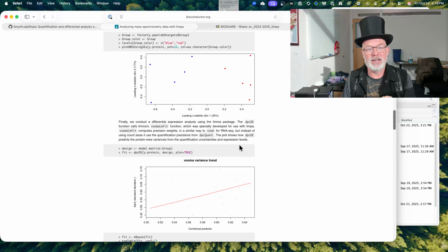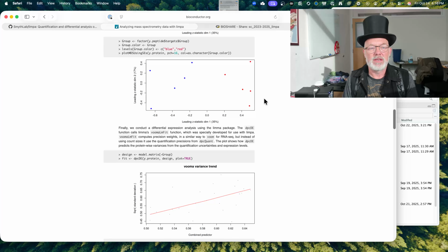Whereas, on the contrary, if you have a group of proteins or peptides, I believe it's done on the protein level, with an intensity of like 5, and those are missing all the time in one condition, then it's most likely random, just because it's below the detection limit. So think of these as a series of errors that you're propagating through the analysis. Like, is my intensity really intense? That's probably seen all the time. My intensity is really low? That can be missing just by chance. And then it takes into account the groups or the conditions.